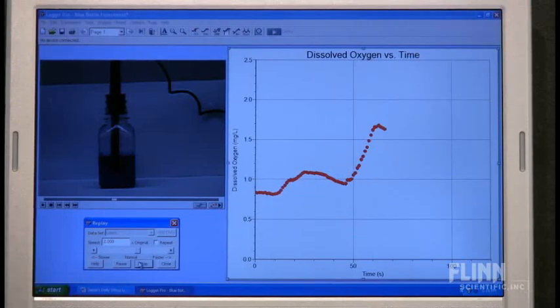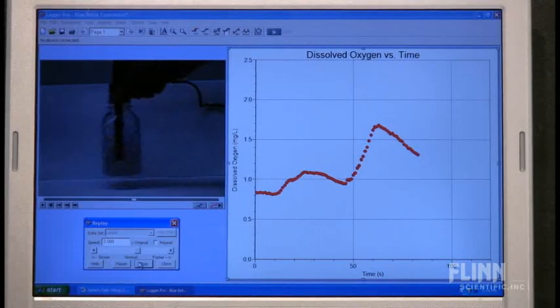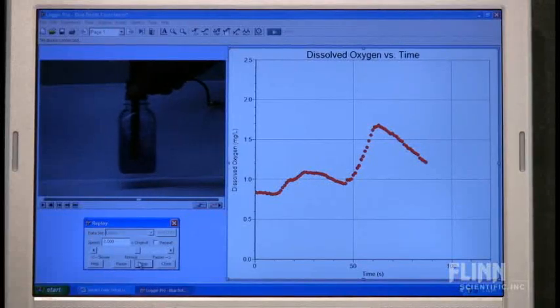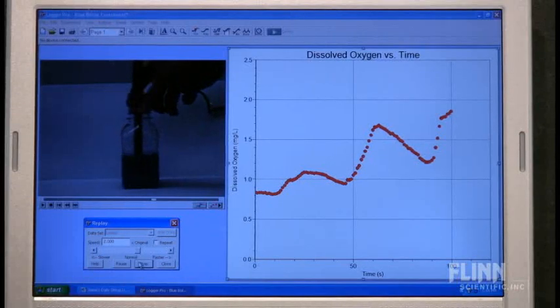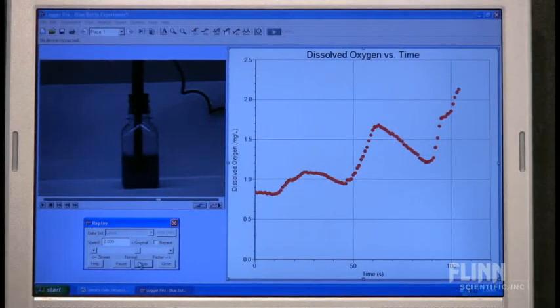The dissolved oxygen concentration goes up. That blue color starts to fade just as the dissolved oxygen starts to decrease. So you can very clearly show to the students that it is the function of the oxygen that's causing this reaction to change color. The more oxygen that gets dissolved, it takes a little bit longer for it to start to filter out of solution, and they can see a really nice graphical representation that the dissolved oxygen is responsible for the color change that they're seeing. So it is the oxidation of the methylene blue that results in this reaction.